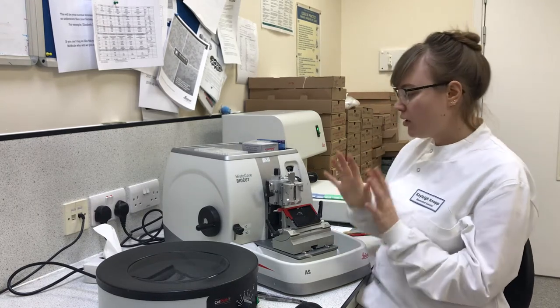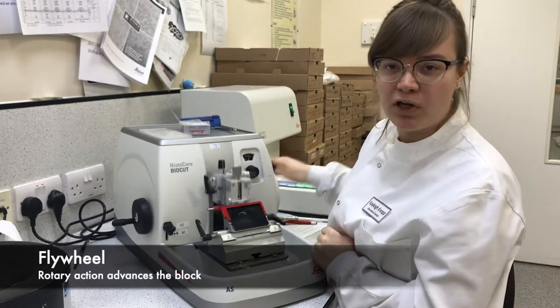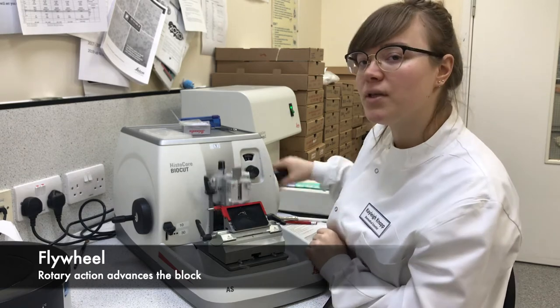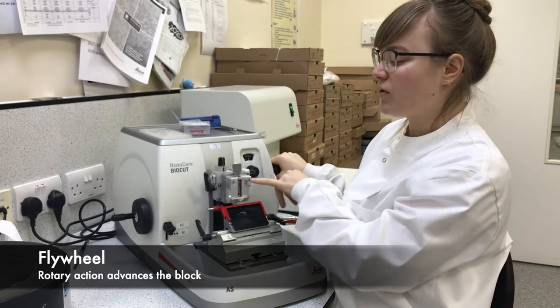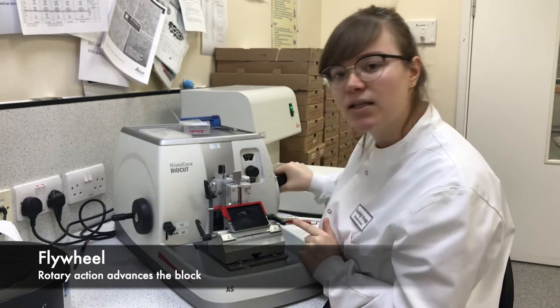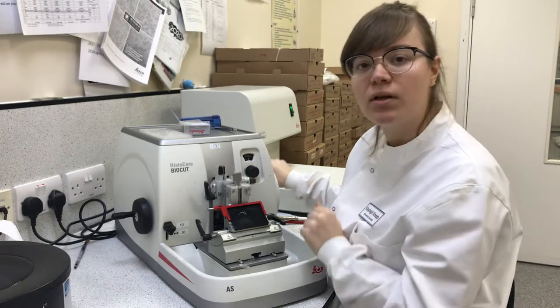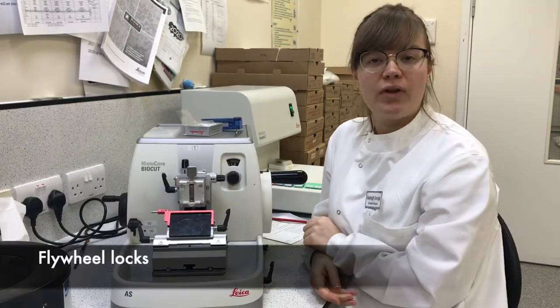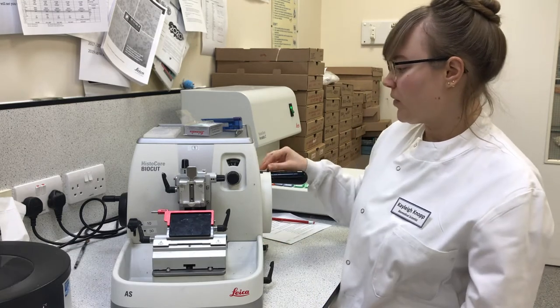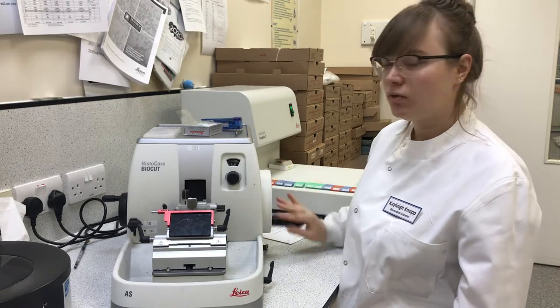This is our microtome. This is your flywheel — as you turn it, the block holder or chuck goes up and down, and at the apex of the turn it advances forward, takes a slice, comes up, comes forward, takes a slice. On your flywheel there are two locks. This one goes side to side — unlock to turn.